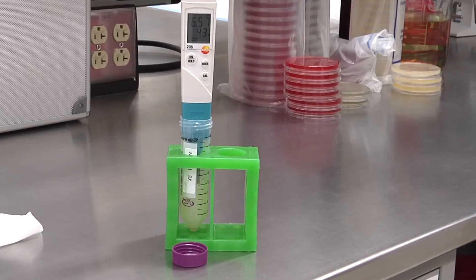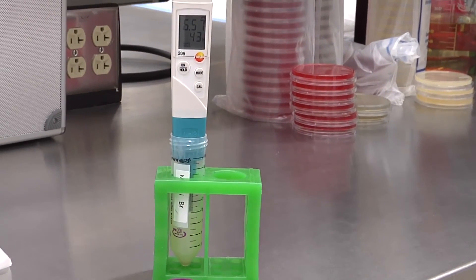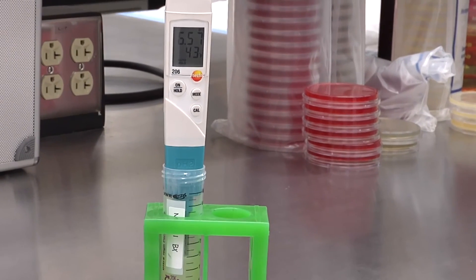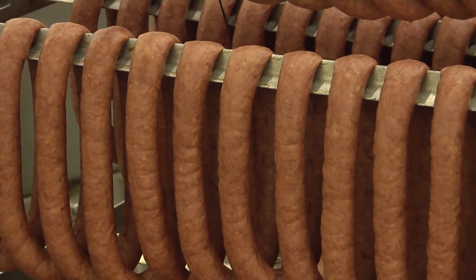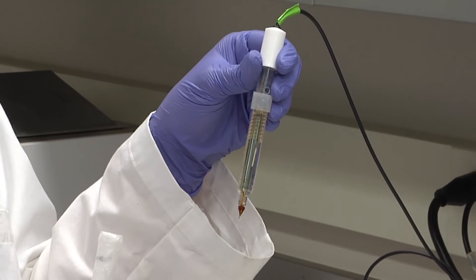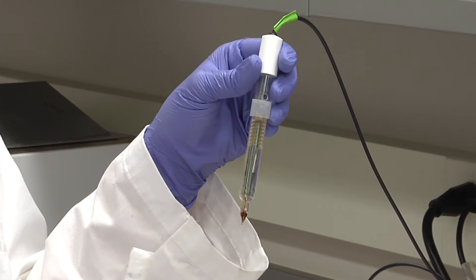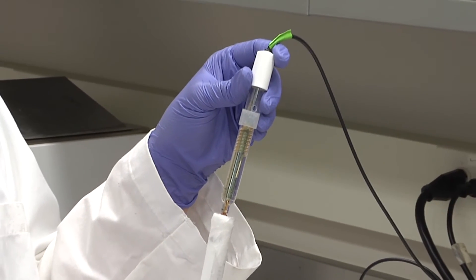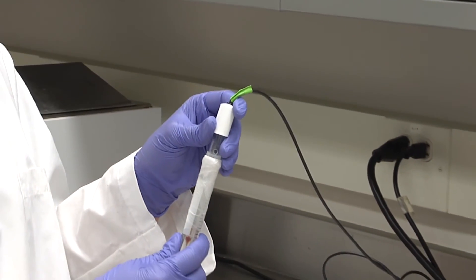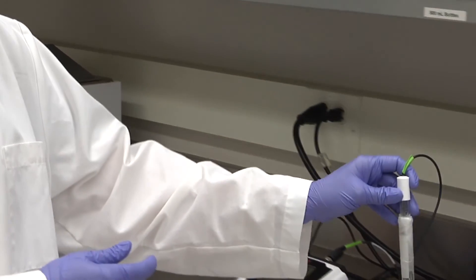Since pH is the measure of acidity of a solution, dry meat products may pose a difficulty when measuring the pH. Dry samples are often a problem, especially if the electrode chosen has a glass tip. Dry meat samples can cause damage to the electrode, which is often a very costly investment to replace.